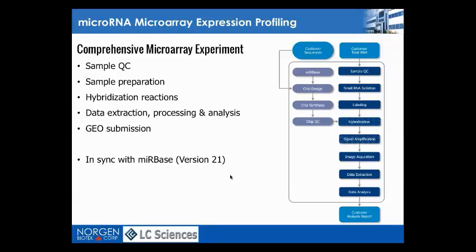That said, there's the caveat that for microarrays you're using your microRNA or your total RNA sample directly, versus next-gen sequencing approaches where you have a pretty elaborate sample library prep involved. So there's still a lot of discussion going on as to which extent you're actually biasing your profile in the library step phase of next-gen sequencing. And there was just recently, 2 or 3 weeks ago, a paper that showed that you're actually biasing your profile there, and it's really not truly quantitative.